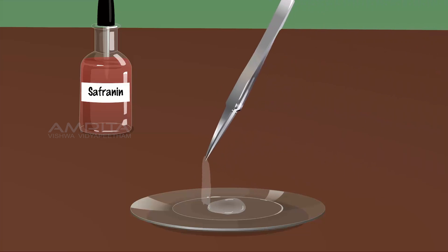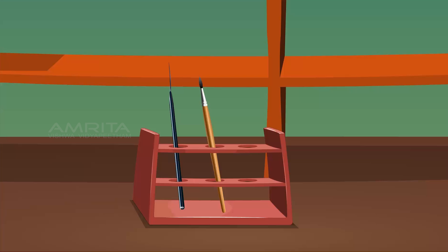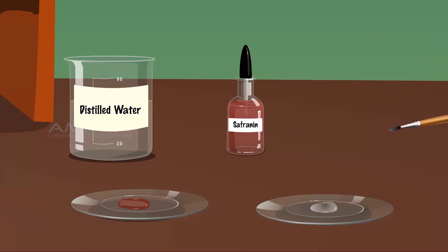Put the epidermis into the watch glass containing water. Using a dropper, take a few drops of safranin solution and drop them into another watch glass. Using a brush, transfer the epidermis into the watch glass containing safranin solution. Keep the epidermis for 30 seconds in safranin solution so the peel can become stained.